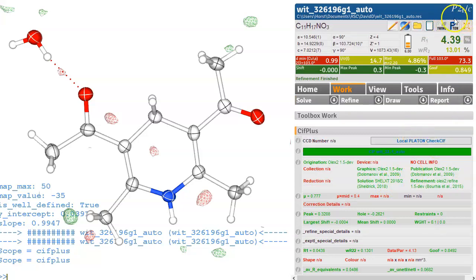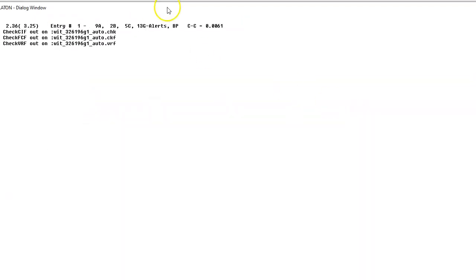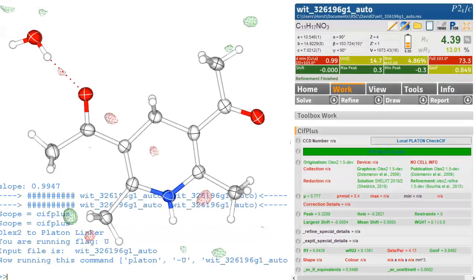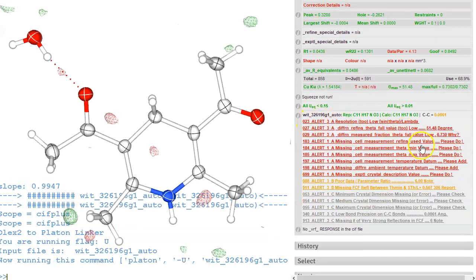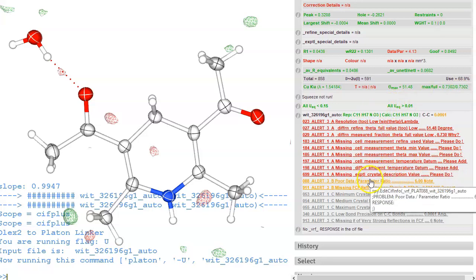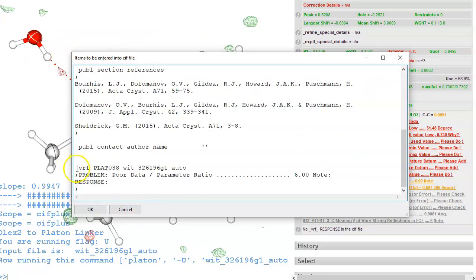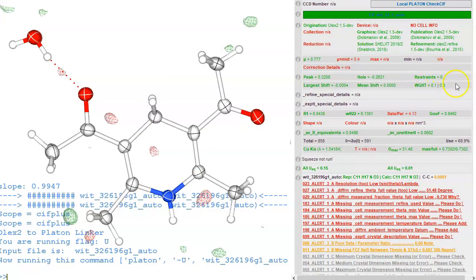So you can also when you've got if you've got Platon installed you can run a local Platon check CIF and that then extracts the problems and you can see a lot of problems here that need to be dealt with so this will not go through. If there is something you cannot change then you can click on that and it gives you this window where you can actually then write why this issue is there so you can just write your response and type it and save it and Olex2 will merge that in with your final CIF file.